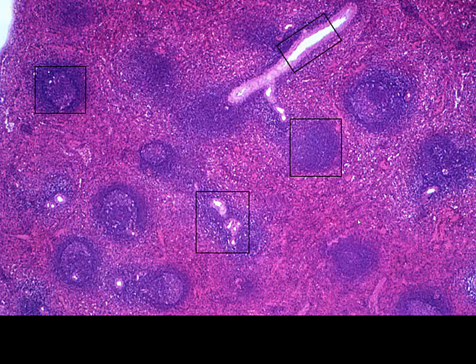Once again, as we look at higher and higher magnification, I believe this is one that we have seen in our lecture podcast. We see our white pulp, and then we see our central arteriole associated with many of these secondary lymph nodules. And understand that the area immediately around that central artery is going to be our PALS, our periarterial lymphatic sheath. Not the entirety of that secondary lymph nodule could be considered PALS, although I think in some textbooks they go back and forth. The whole thing is white pulp, but the PALS is that particular part that ensheathes and goes around those vessels.